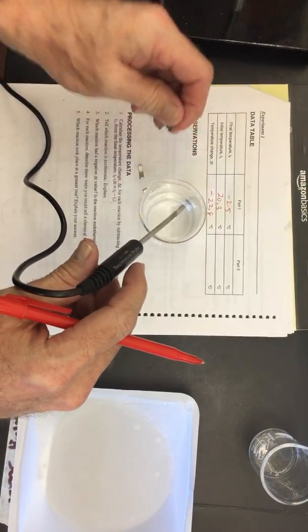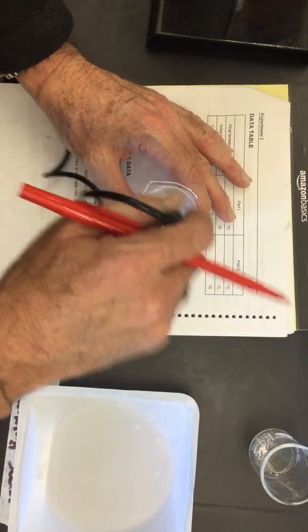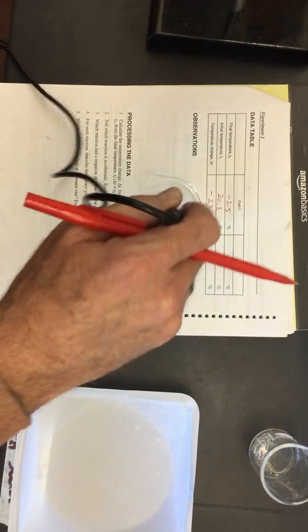And I'm going to go ahead and add the magnesium. And show you guys, whoop, we have to start this. Okay, my bad. It started at 19.99, so that's going to be our minimum temperature. And this is going to be going up like this.